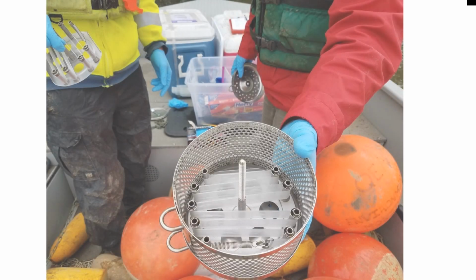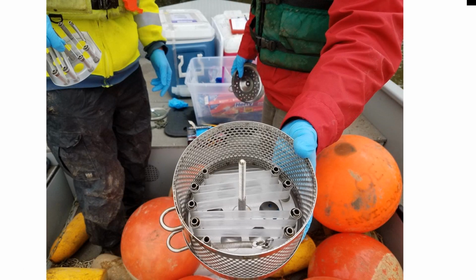In this photo, you can see the carrier and LDPE tube inside the stainless steel protective canister before deployment. Custom-made protective canisters can be used as long as those materials do not leach out chemicals of interest to the study. Site conditions and target media will impact the type of equipment needed to deploy the device. Typically, you will need deployment hardware such as cable and clamps, floats, tie-down anchors, and the tools required for SPMD assembly.